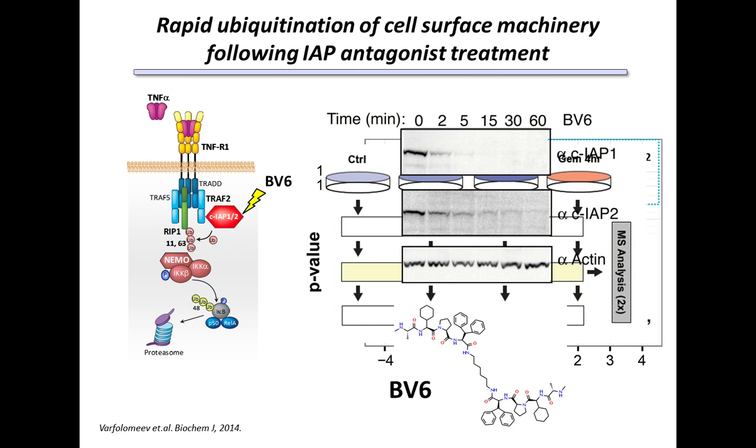Now, one of the first places that we recognized the power of using KGG profiling was in a series of studies that we have been working on over a period of years with Domagoj Vucic's group, particularly focused on the IAP family of E3 ubiquitin ligases, initially thinking about CIAP1 and 2. And we were working on those in large part because we had a nice tool compound, a molecule known as BV6, that's known as an IAP antagonist. Now, this antagonist of the IAPs actually functions in a really interesting way, namely that it's an inhibitor by activating. It causes the CIAP proteins to ubiquitinate themselves and subsequently get degraded, as you can see on the right-hand side of this slide.